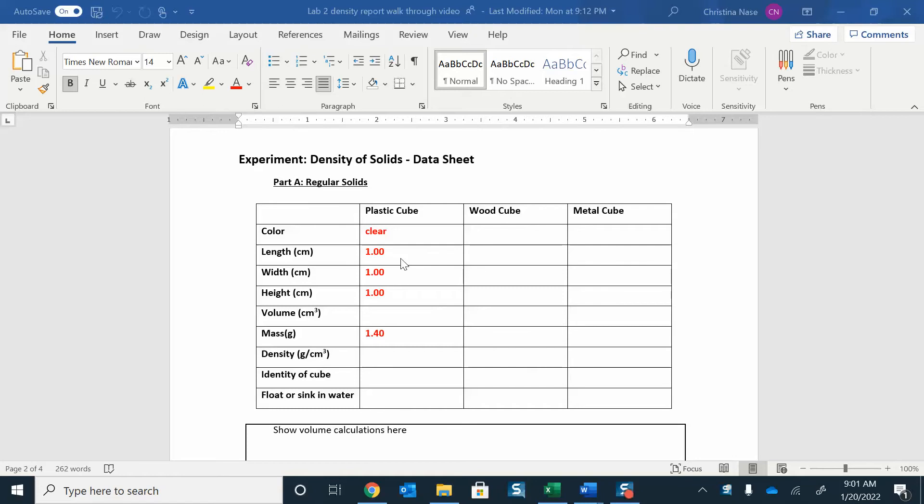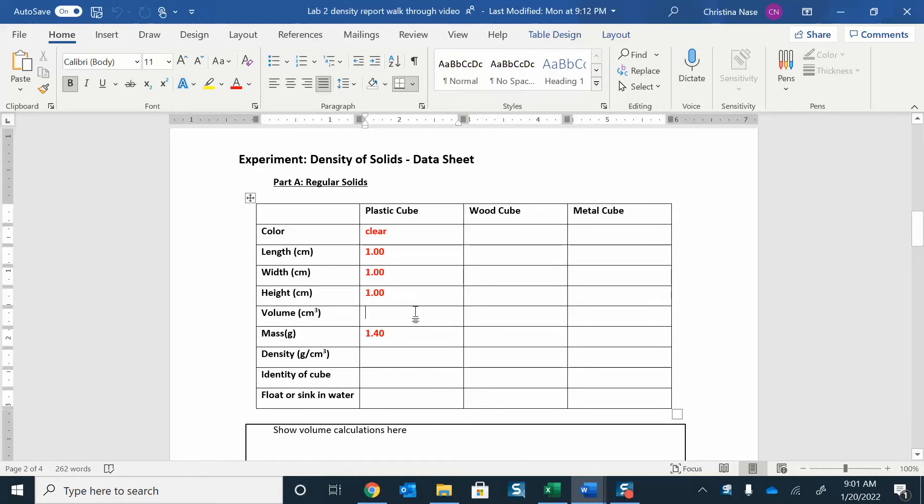Then you're going to measure the length, the width, and the height of the cube. They should be fairly even, but you do want to measure each side just in case there's any irregularities. The one that I had was a tiny one, it was one by one by one.